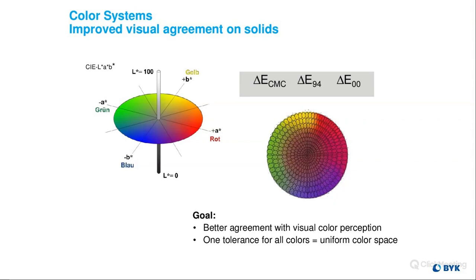And then when you're using the instrumentation, that eliminates any differences in the human eye from person to person. Exactly. It's known females can see color better than males. The older you get, the more challenges you may have. And I know we have the Farnsworth Munsell hue test that's out there.